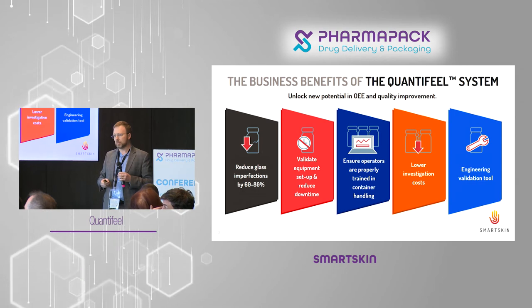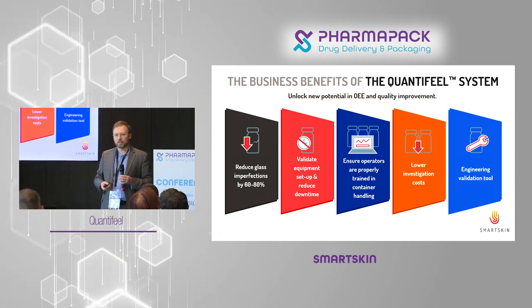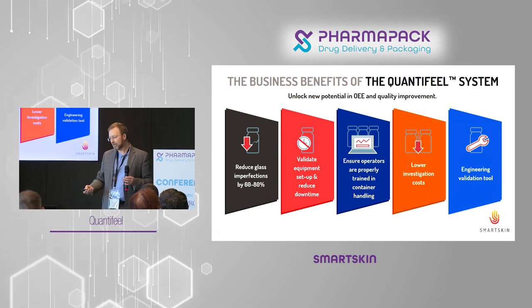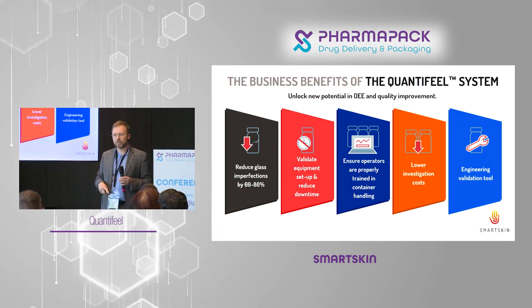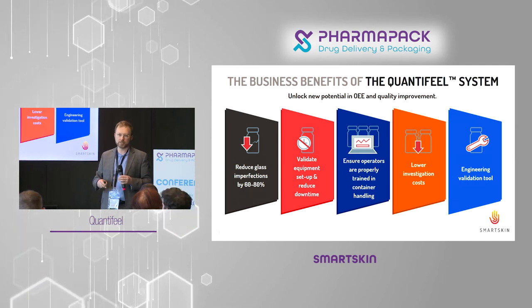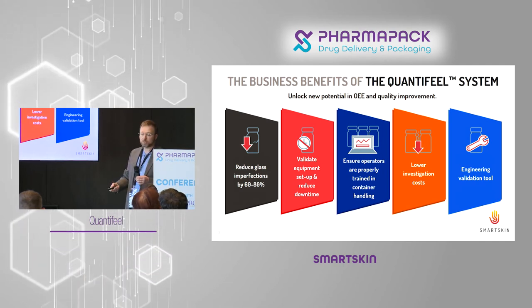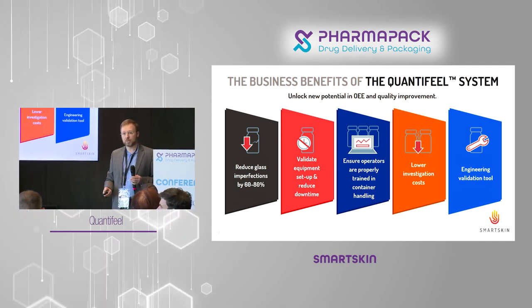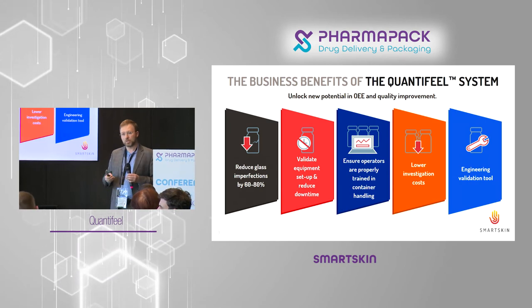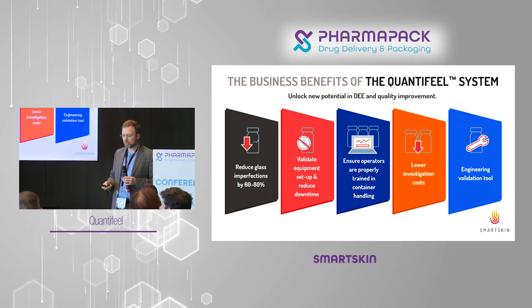You'll often see people feeding vials. One operator does it slightly differently than another. You might have a standard process, but they think their way is just fine until you actually measure it. Then you can say, your way is exerting more force on the container than the other person's is. It's also used as a tool in investigations. When a big investigation does come up, it's a way we can quickly isolate where problem areas worth focusing on might be.